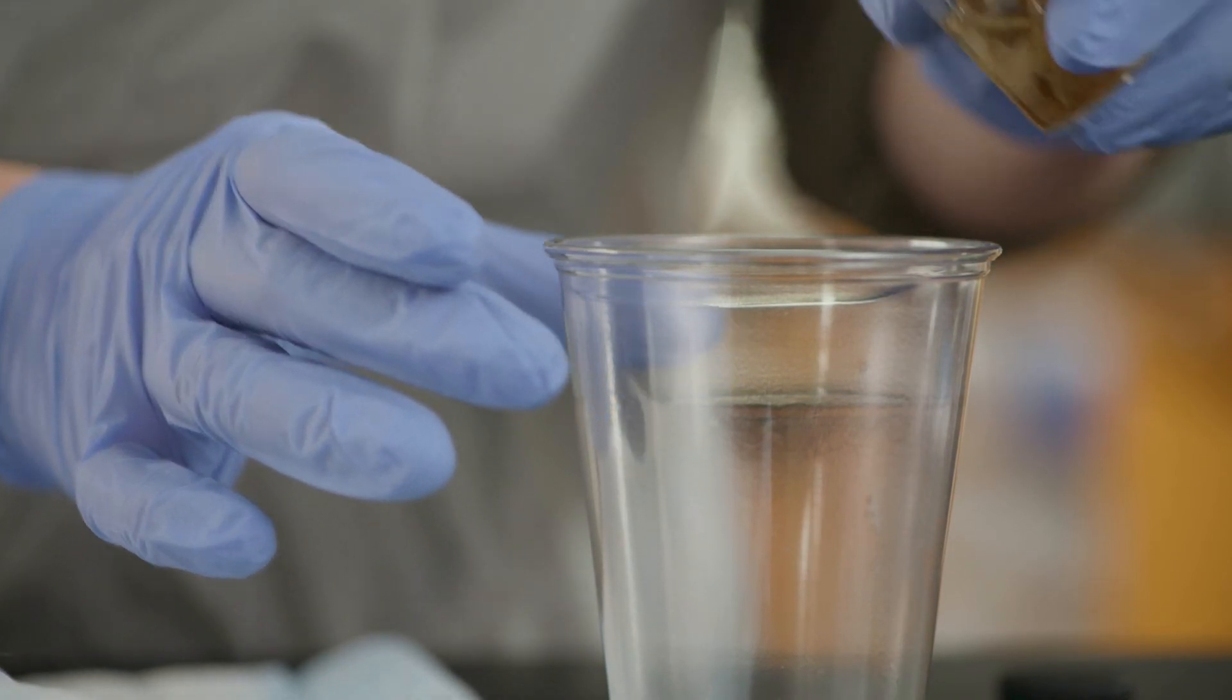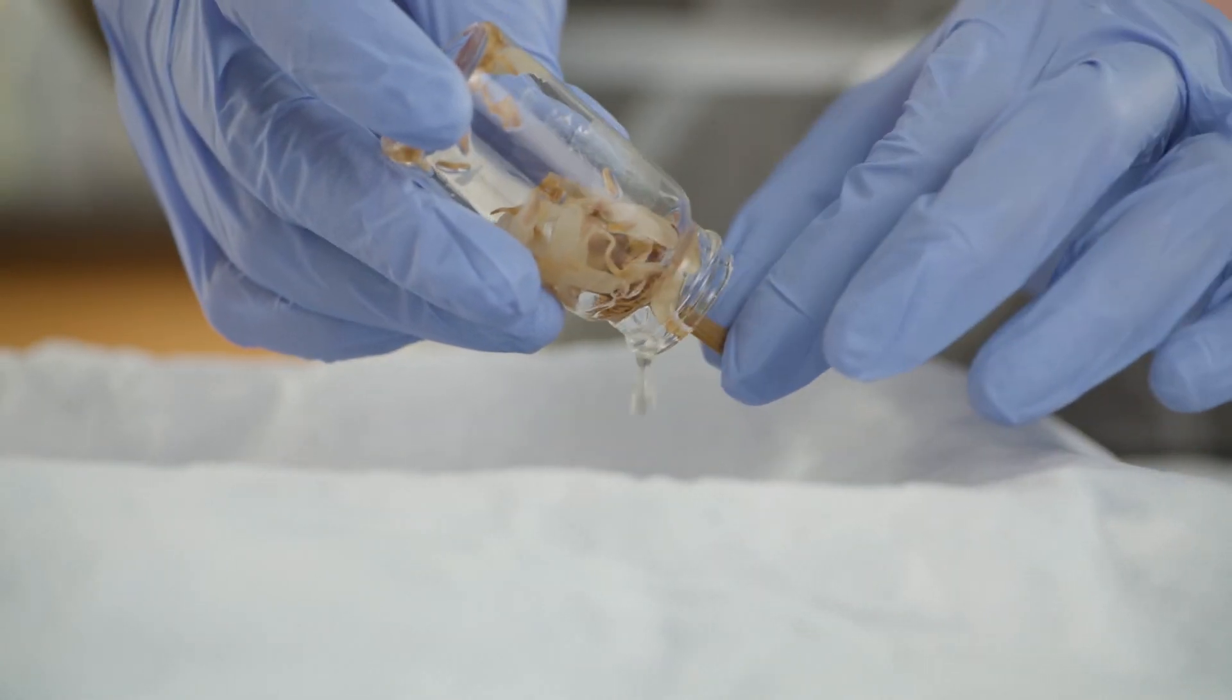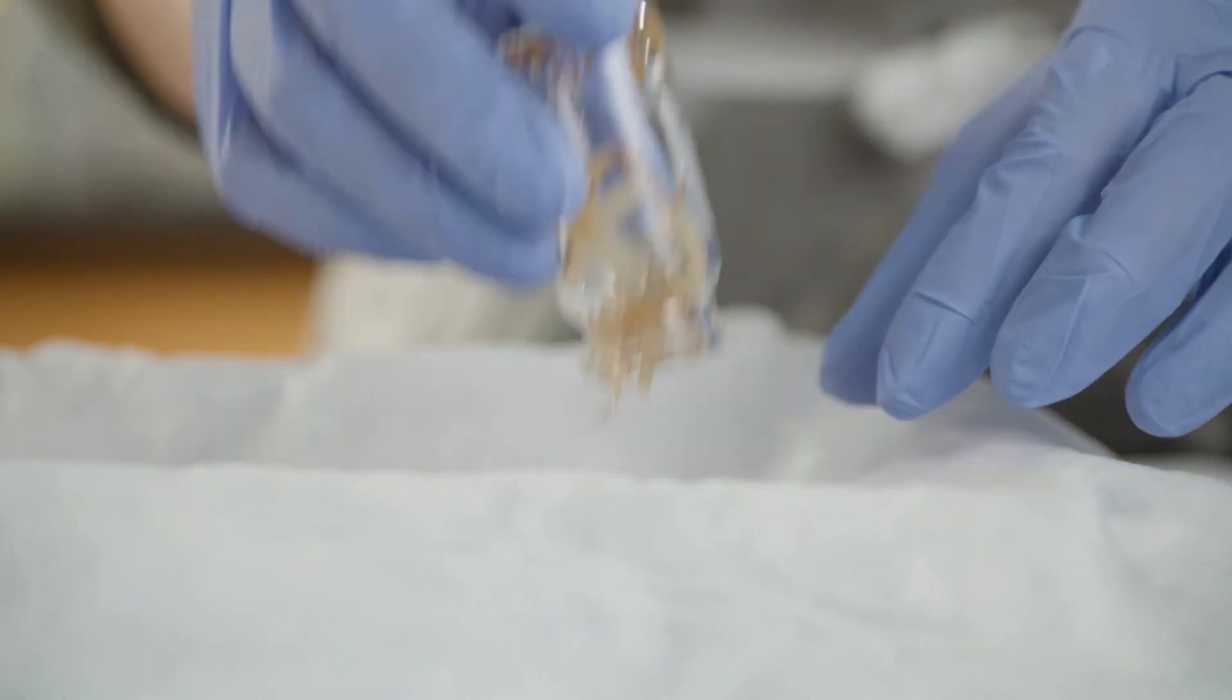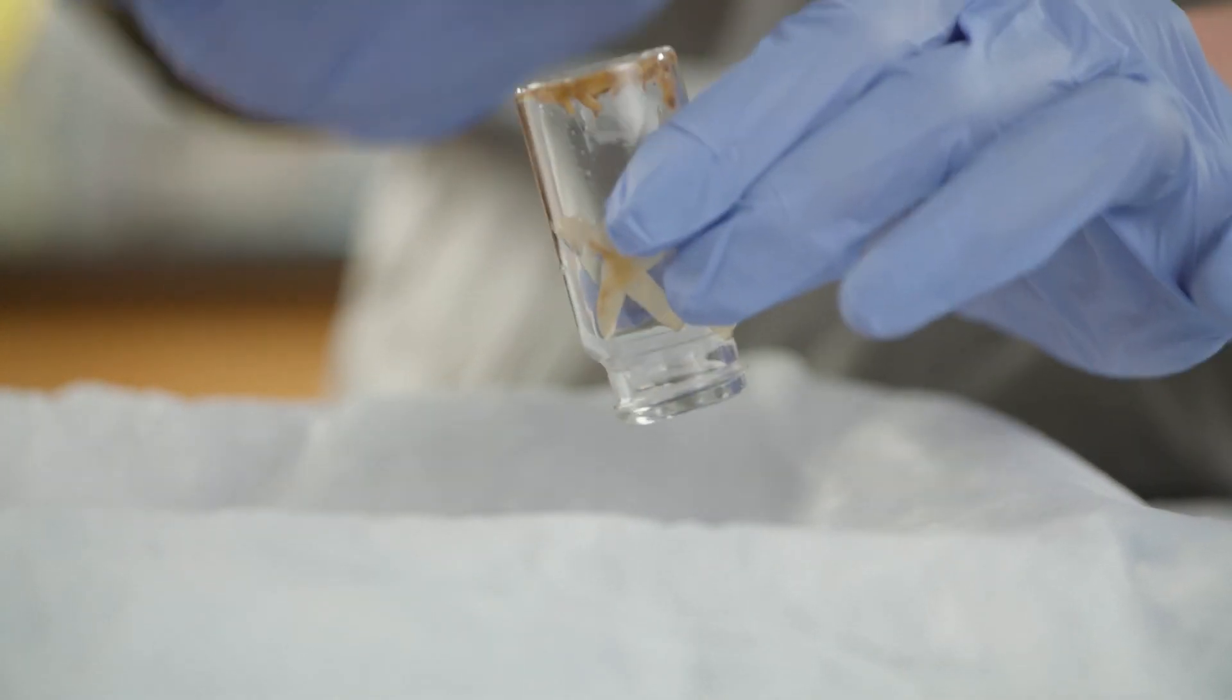This may require you to drain most of the preservation fluid into a disposable cup and then pour out the structures onto your dissecting tray or paper towels. These structures can still be identified and counted for the investigation.